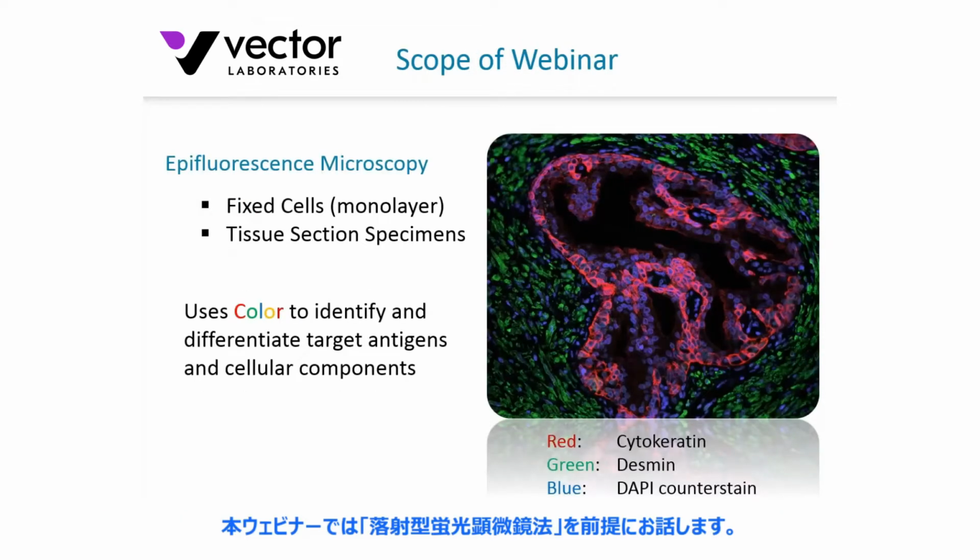Okay, so the scope of the webinar today, we'll be talking about epifluorescent microscopy. I do know there are a lot of investigators out there working on live cell microscopy and super resolution microscopy. We can't do justice to those in the 20 minutes we have, but epifluorescence microscopy is a workhorse application. It's a mainstay of many labs, and therefore we'll be focusing on that today.